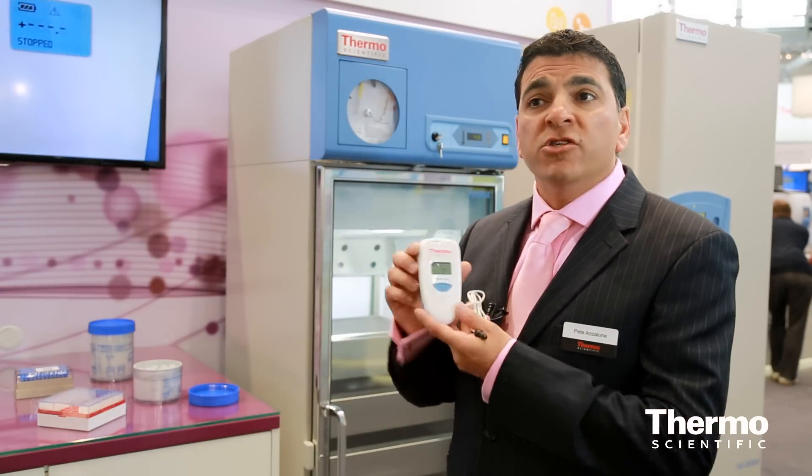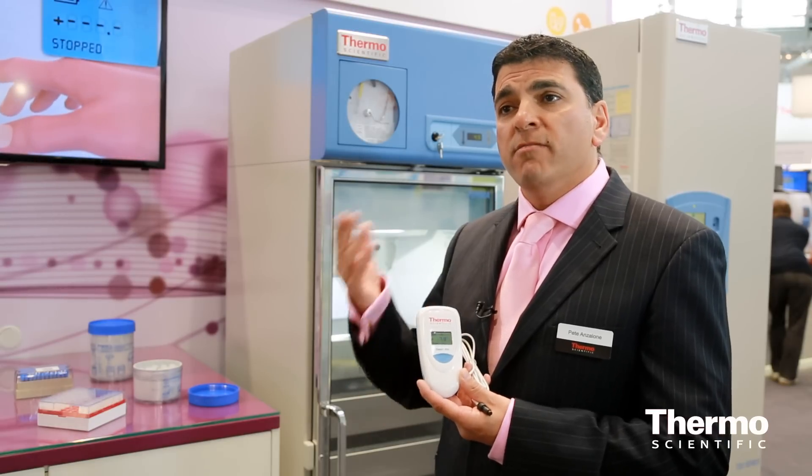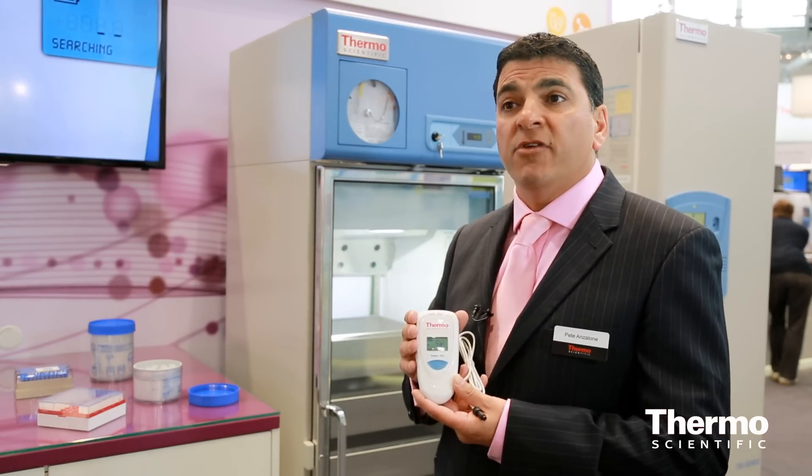What we have within the Thermo Scientific portfolio is SmartView. Any instrument is not immune to failure, so ultimately you need something which is autonomous from the instrument — and we have SmartView. It's a remote monitoring system which is wireless and connected to a server, so remotely you can access your server and check on your instruments from the comfort of your own home.